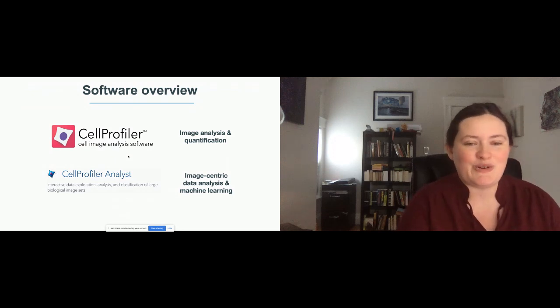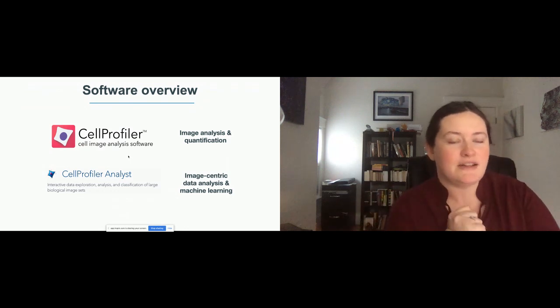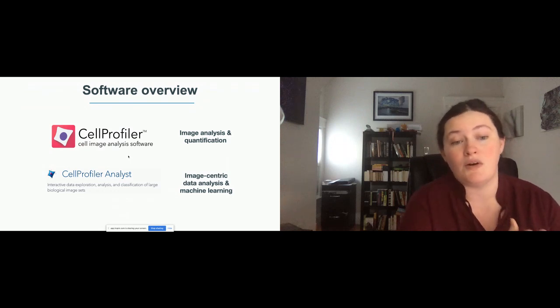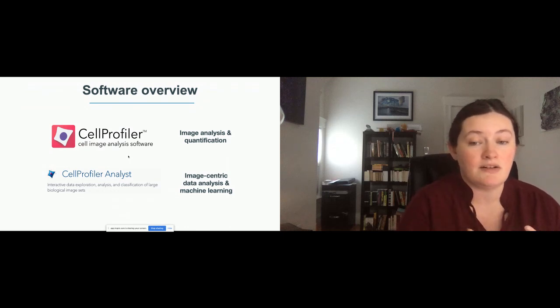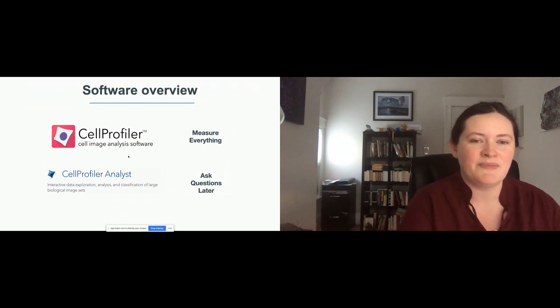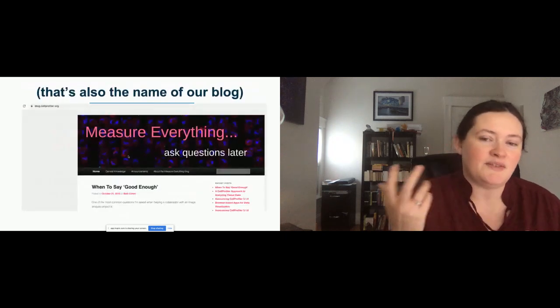But so we also provide a tool called CellProfiler Analyst, because CellProfiler essentially just takes you from images to spreadsheets or databases. And as much as I love spreadsheets and databases, it's not actually the answer to a question. And so we've provided this tool called CellProfiler Analyst so that if you have spreadsheets or databases based on images, whether or not you did that analysis in CellProfiler or not, so they're designed to work together, you can then explore your data and do things like machine learning to actually try and find your phenotypes based on what you've measured. So I said our lab motto is measure everything and ask questions later. CellProfiler is the measure everything, and CellProfiler Analyst is the ask questions later. This is also the name of our blog.